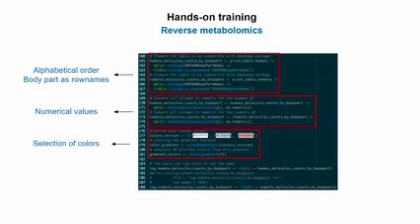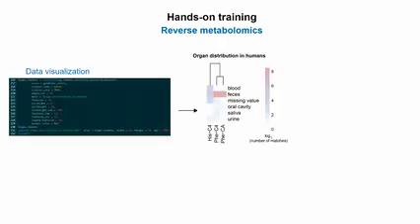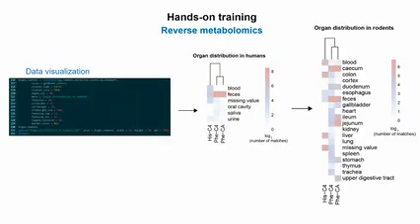We place the body parts, so the data frame only needs to contain numerical values, but here the first column will be Uberon body parts, right? So then we just place that as row names, and then all your data frame will be composed of numerical values, and then we log scale, and then you should have these first two heat maps that will be generated, one for human and one for rodents.